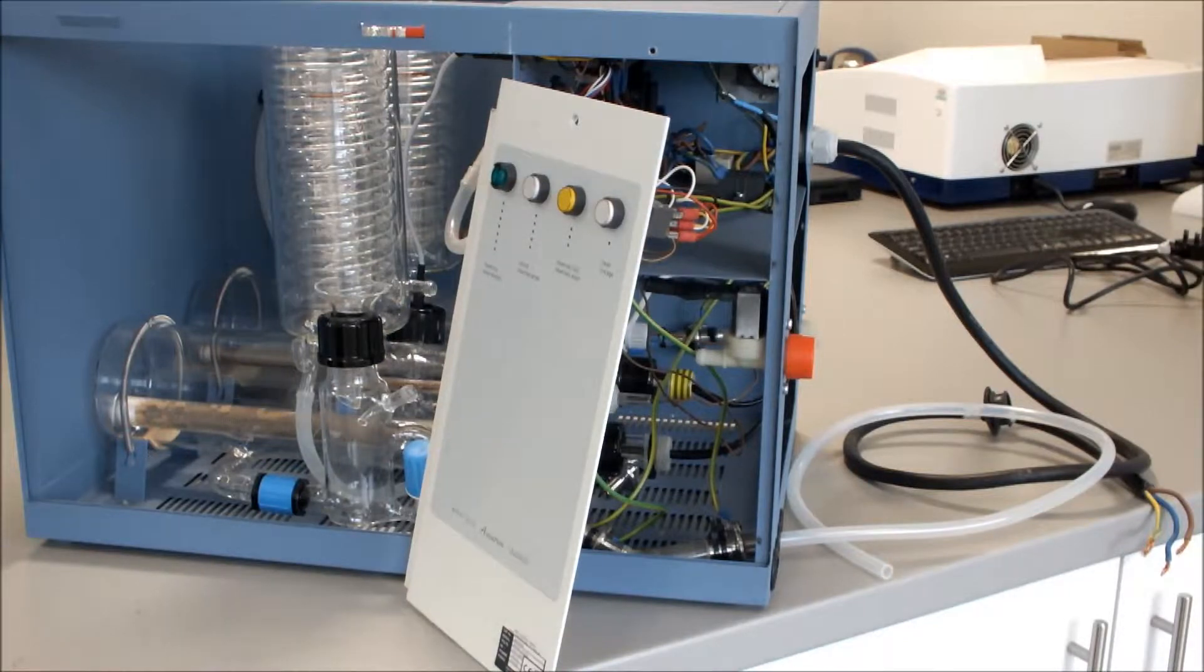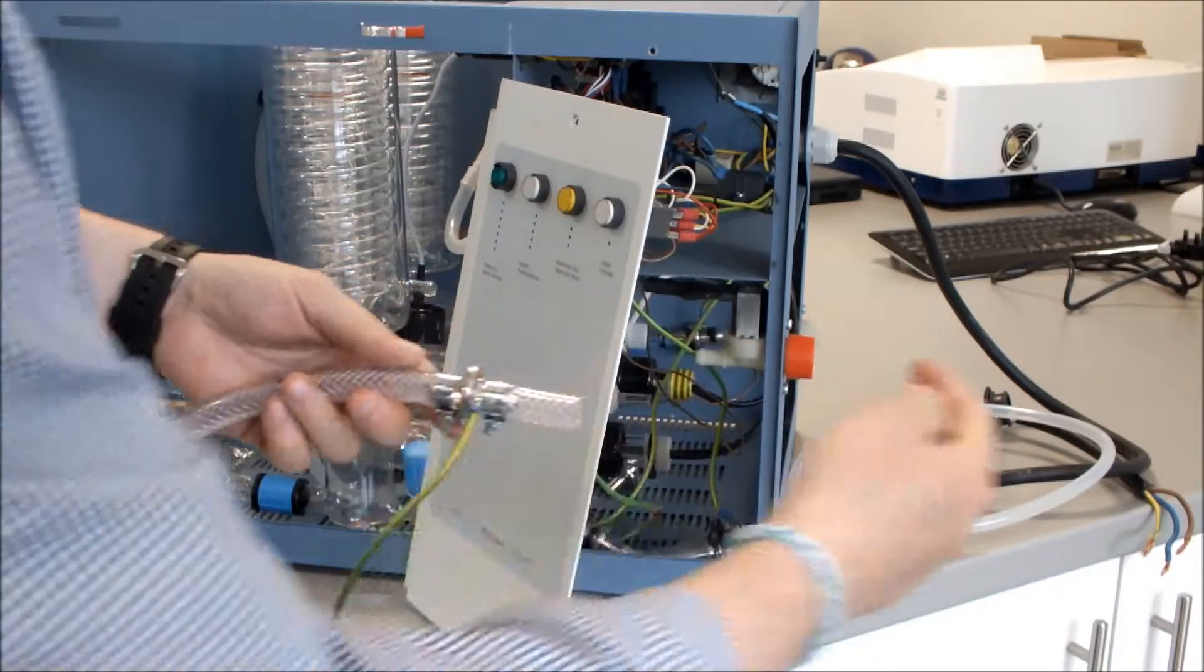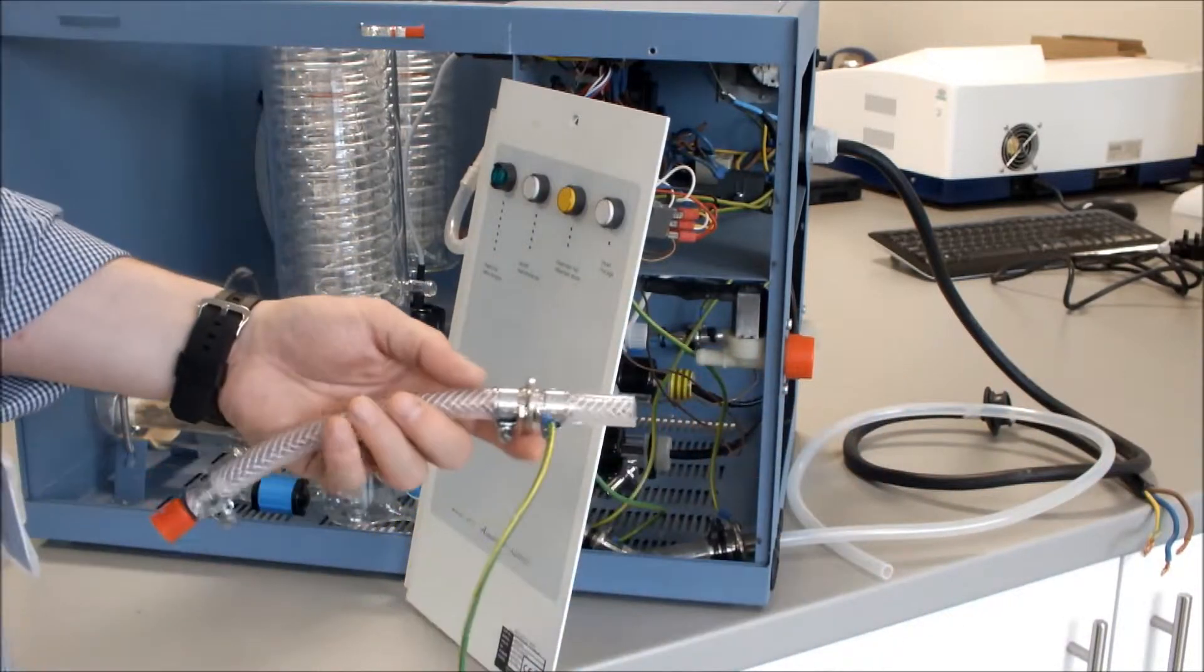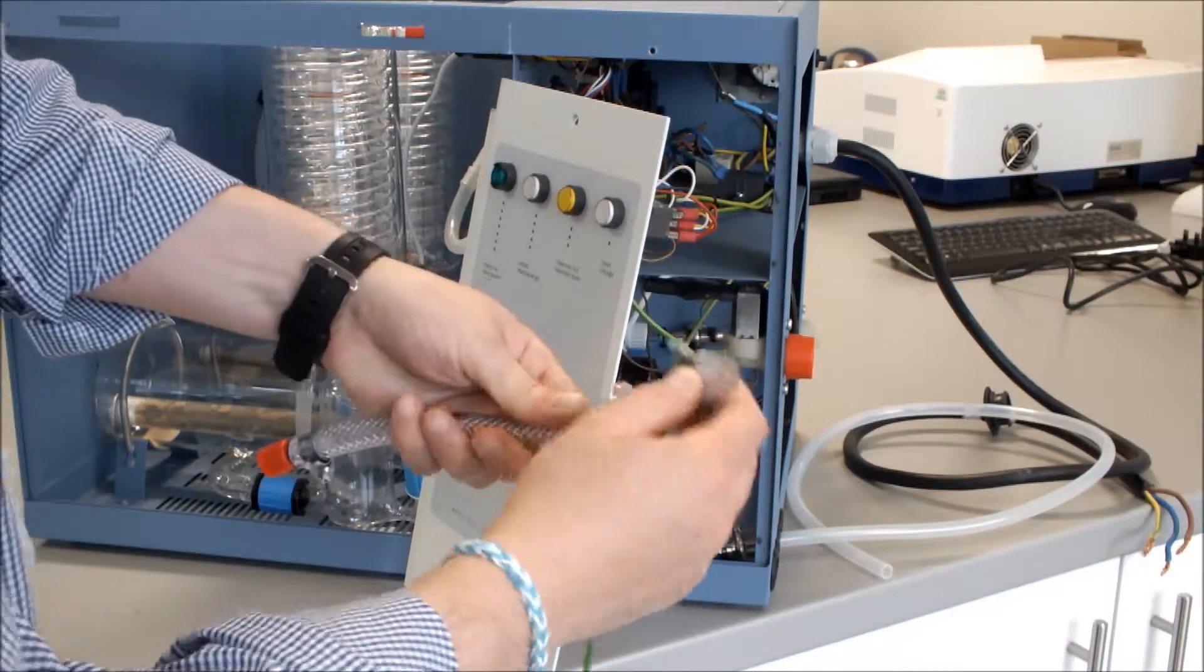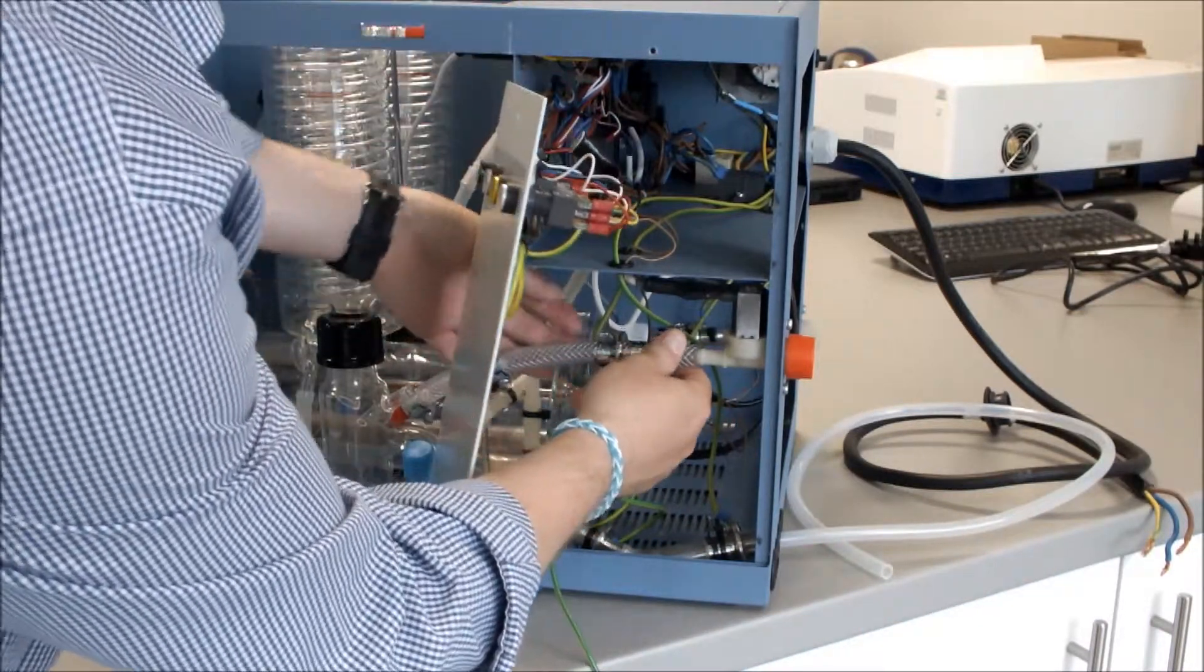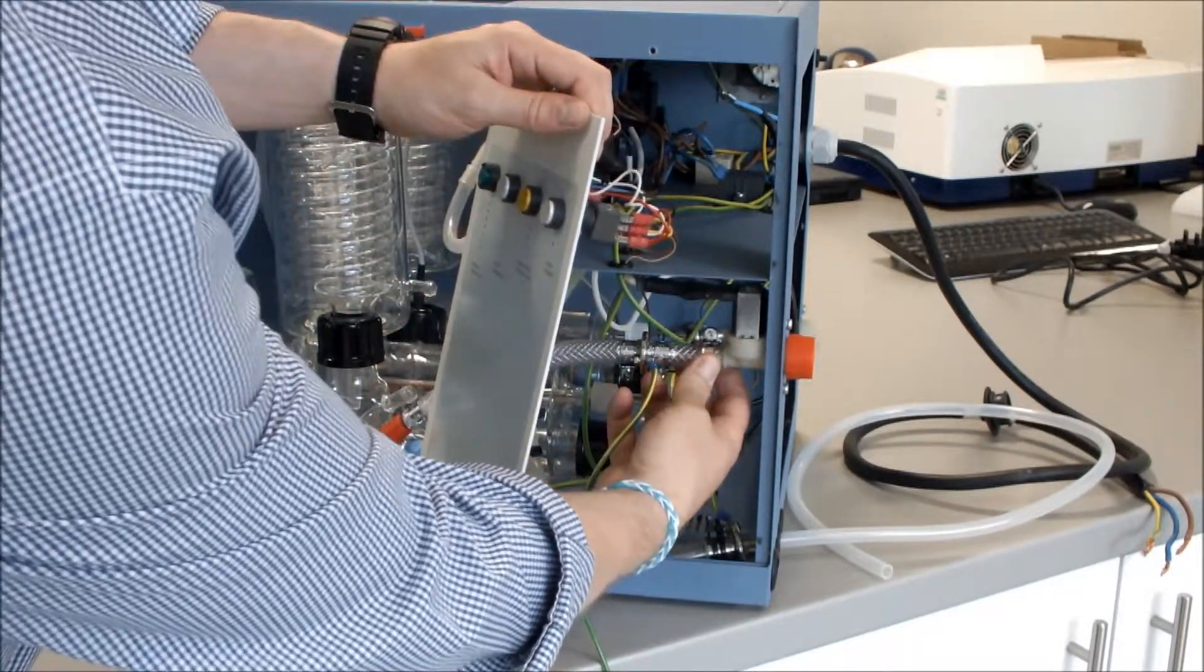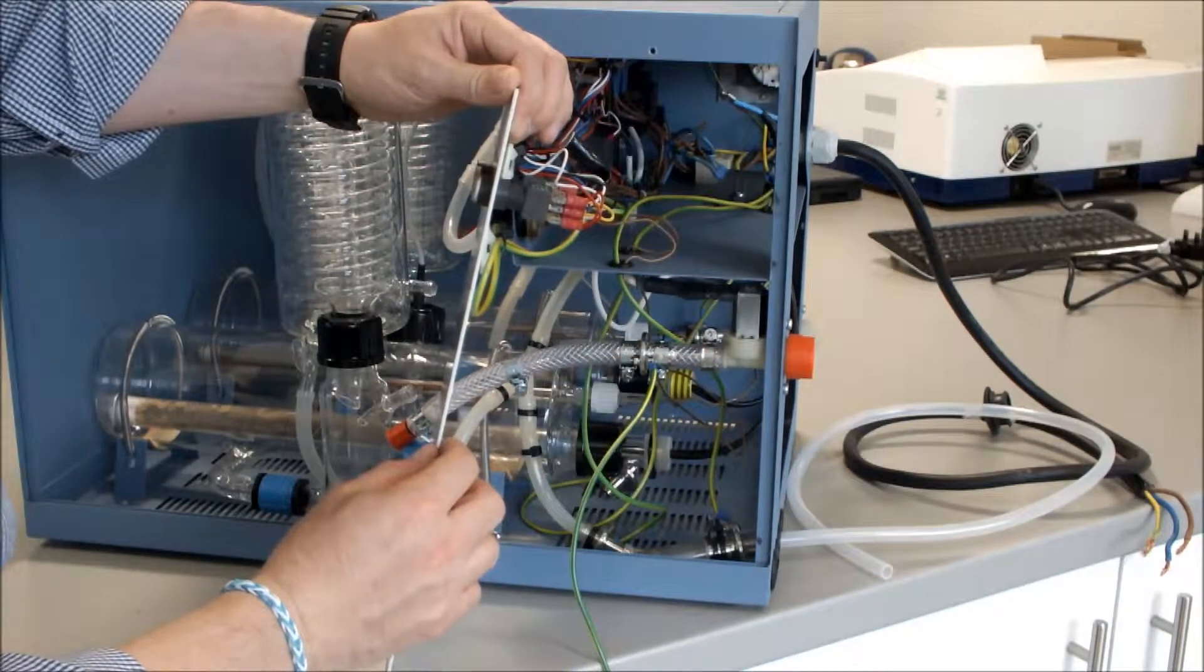The next thing to do is to connect our deioniser pipe assembly to our water inlet solenoid. First, we fit our jubilee clip onto our tubing, then fit the tubing onto the solenoid. We can then tighten up the jubilee clip.